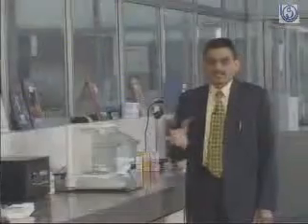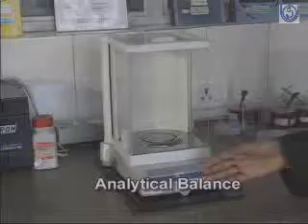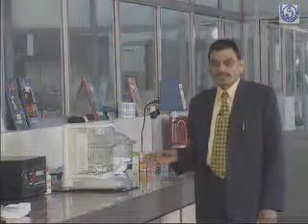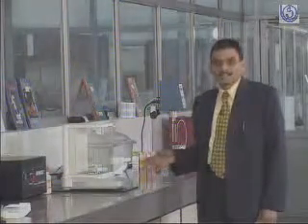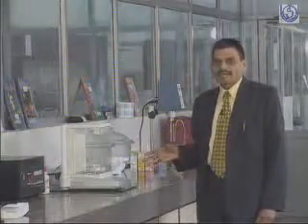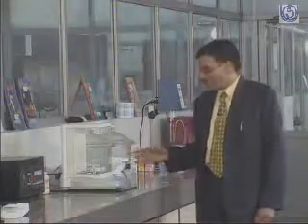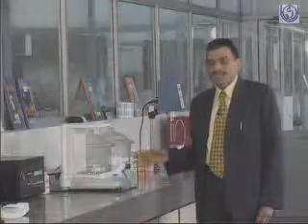Now we are in the instrumentation section of this laboratory. You see there are different equipments, and I will explain a few of them. This is the analytical balance, and this balance is basically the backbone of the laboratory. When you start any analysis, you have to use this analytical balance, because you have to weigh accurately the chemicals, the reagents, and the sample. This is a very sophisticated balance where we can weigh up to 0.01 milligram of any chemical or any sample.